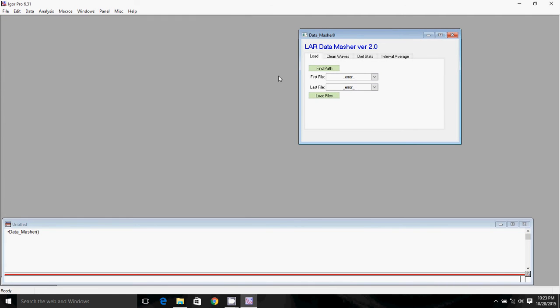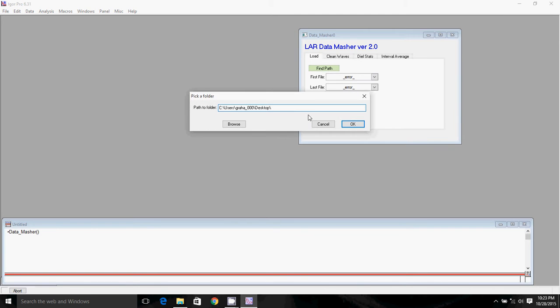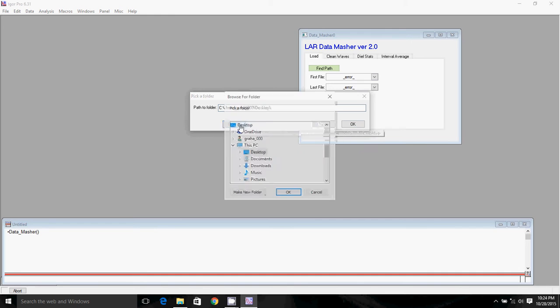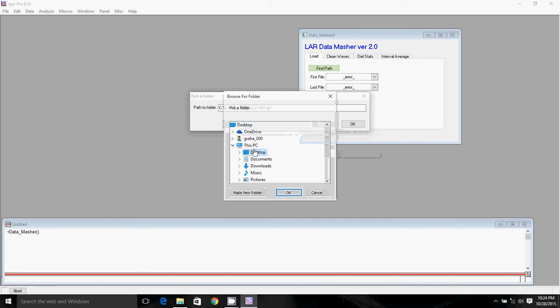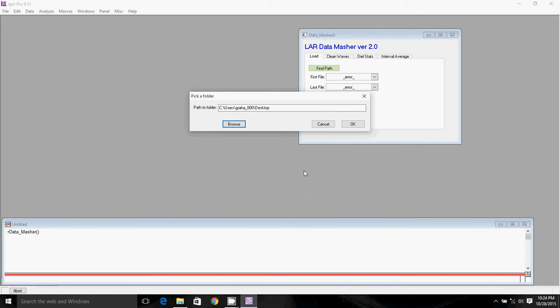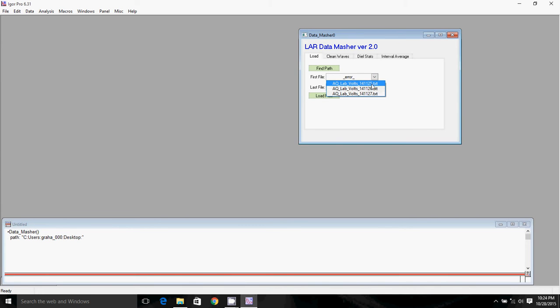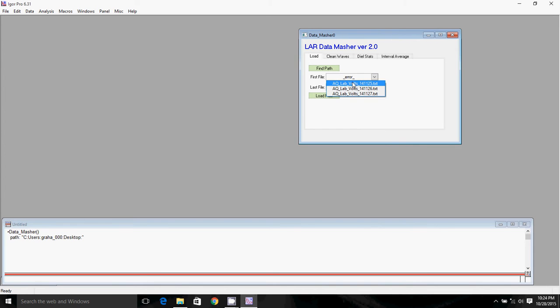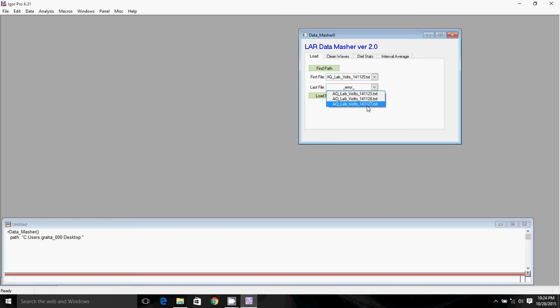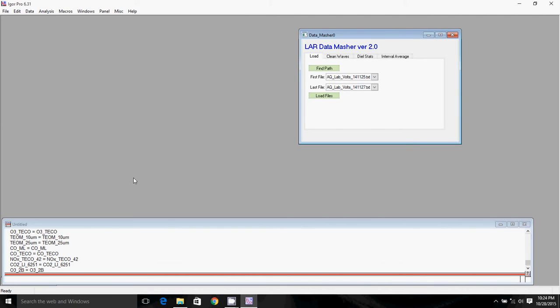So to load our data, first we need to tell Igor which path our data is going to be in. So we click find path. I'll just click browse, and I'll click desktop, because that's where all of my data is. I'll click OK and OK. Then I'll select my first file. You can see it's got all of the three different data files here. I'll select the first one, which is the 1125 file chronologically, and the last one chronologically, which is the 27th. We'll click load files. You can see down here that the data has been loaded.